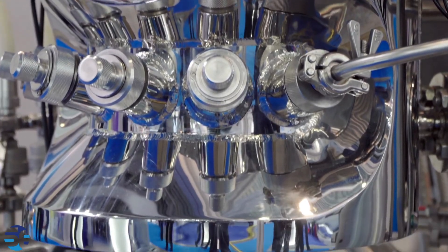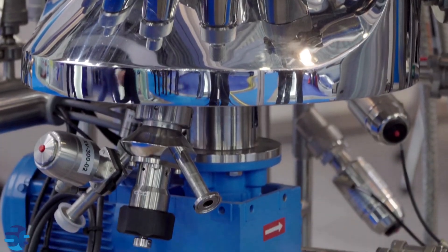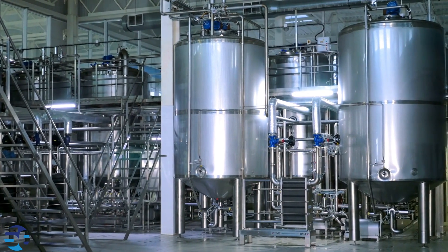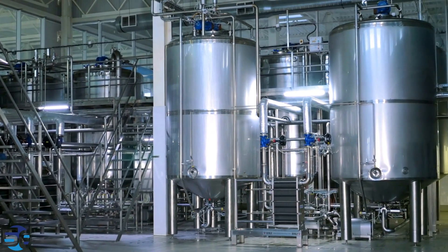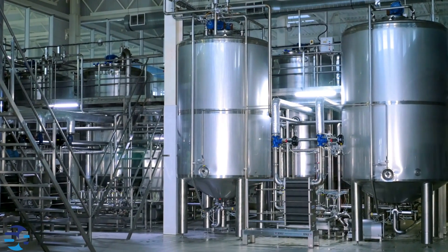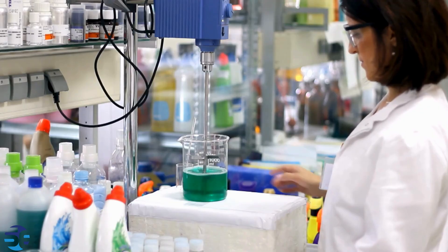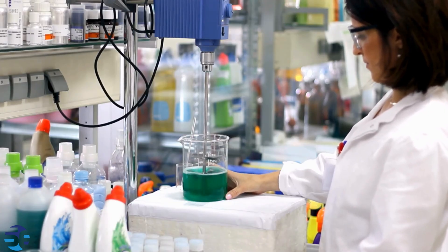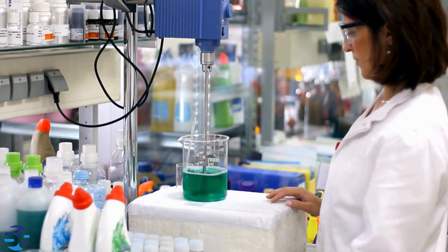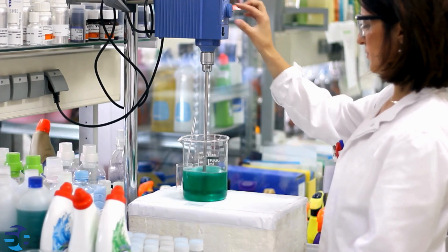High-pressure autoclave reactors find applications in various fields due to their ability to create controlled environments for chemical reactions under elevated pressures and temperatures. In chemical synthesis applications, high-pressure conditions can facilitate chemical reactions that might be challenging under normal atmospheric pressure. Autoclave reactors are used for the synthesis of specialty chemicals, pharmaceutical intermediates, and fine chemicals.